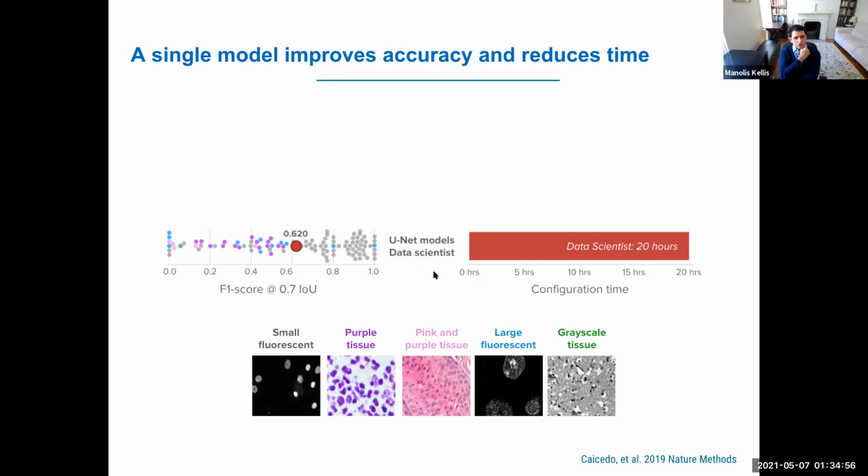So this image is harder to segment because you just don't have enough training for that type of image? Exactly. I think that's one of the issues in this specific data set. There is imbalance in the type of annotations that we get for each of the data sets, which also represents the real world situation.